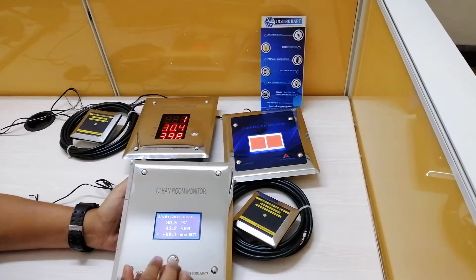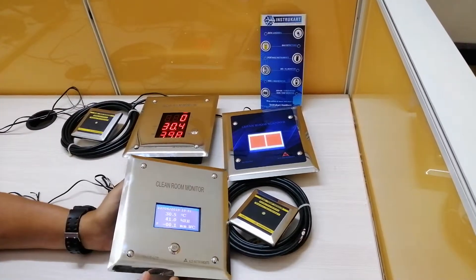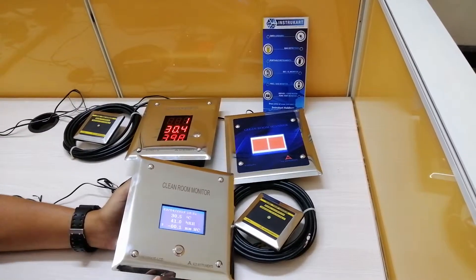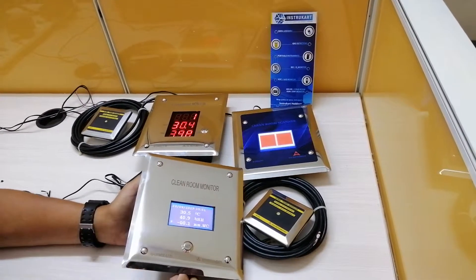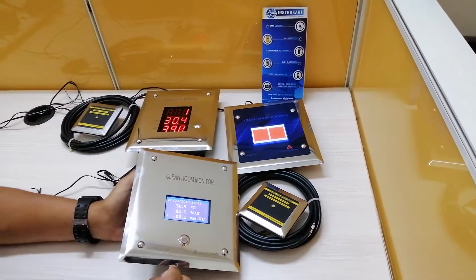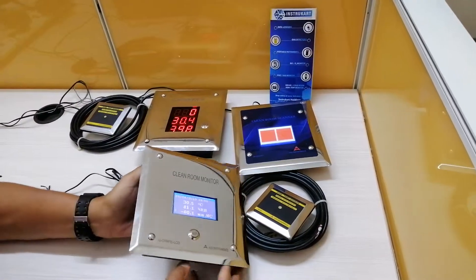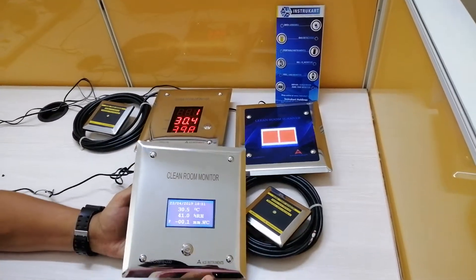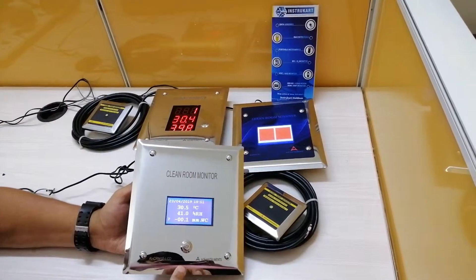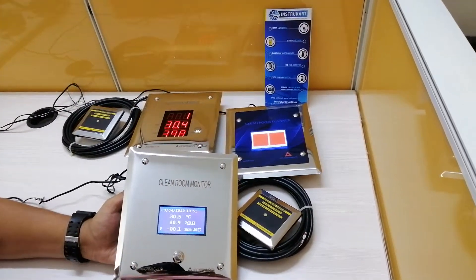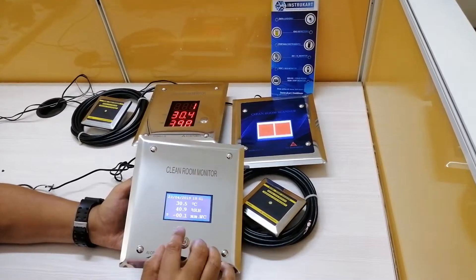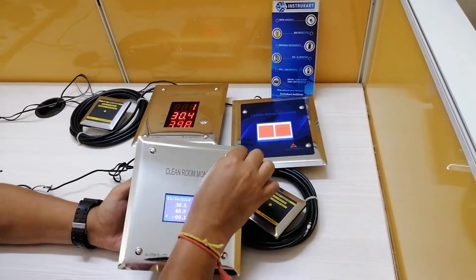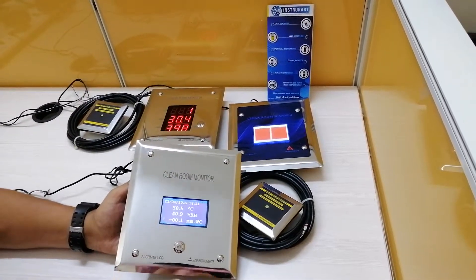The calibration is valid for one year and is traceable from national and international standards. Should you need to install this system, it can be installed into modular panels with provisions for that. It has an artistic design so that dust doesn't stay on this particular monitor. It slips off. You have the setting keys inside when you open these screw caps to do the settings.